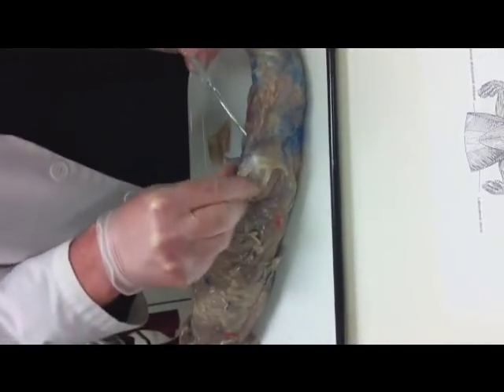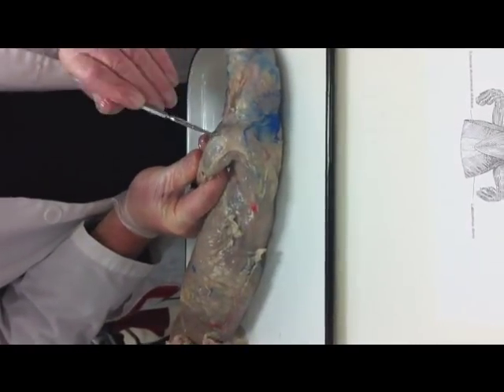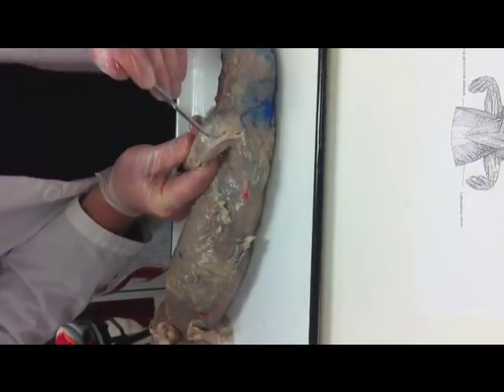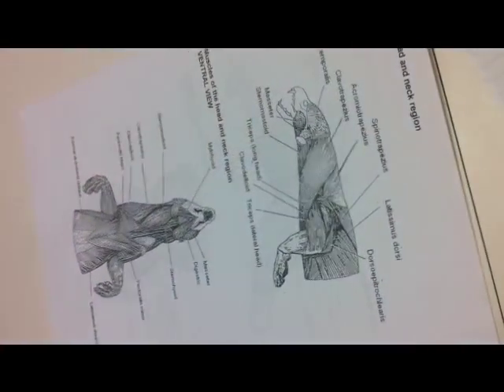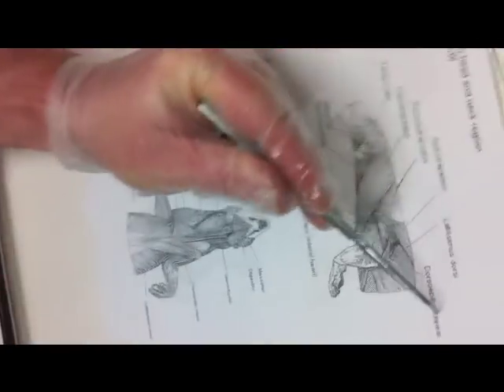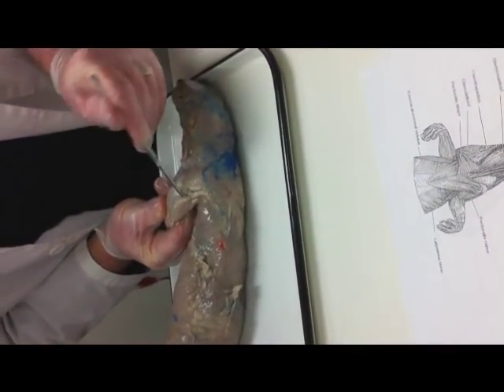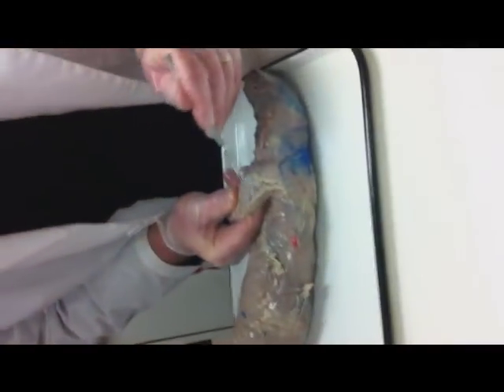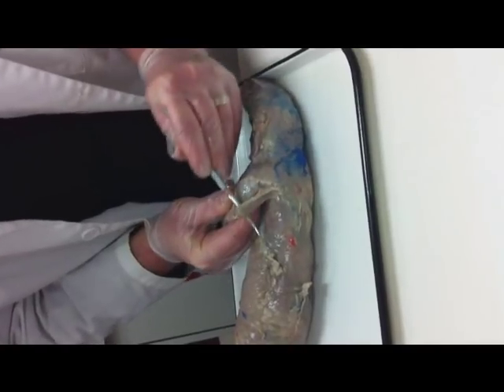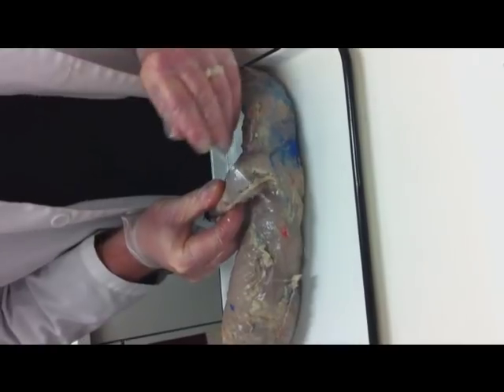Now, as I start to look, I'm probing away and I'm exposing. Just that little bit of exploration there, I've noticed that I've got this muscle here along the upper forearm, and it's called the dorso epitrochlearis, and that's clearly this muscle here. So when I probe underneath of it to separate it from the other muscles, there we go, I can see that that muscle is separate, and now I've pulled it out. Now I've identified it. That's my dorso epitrochlearis.